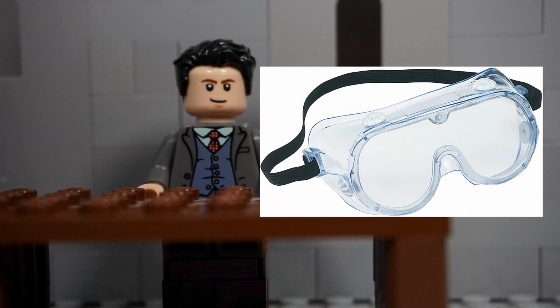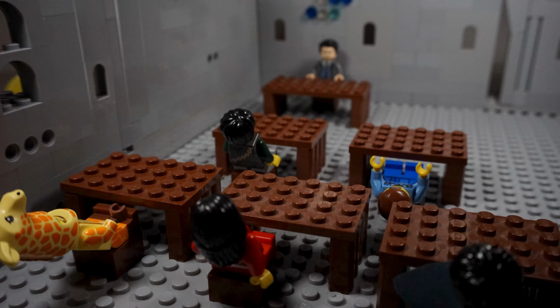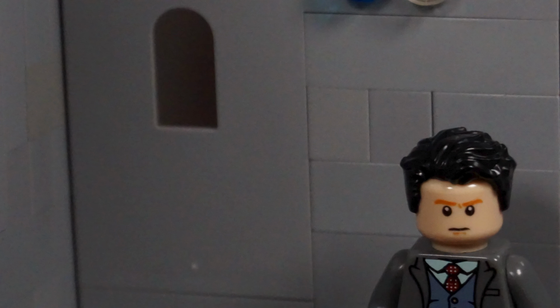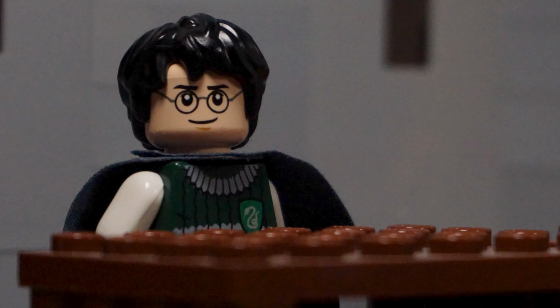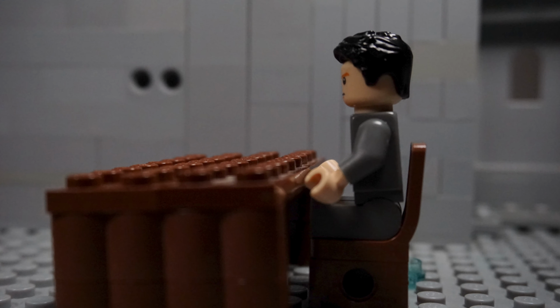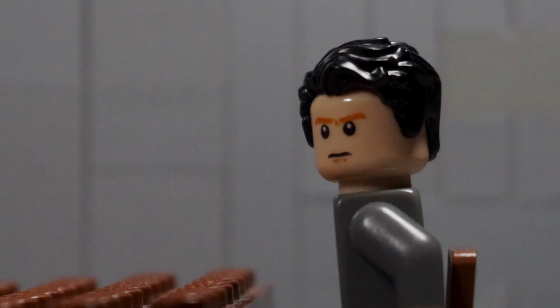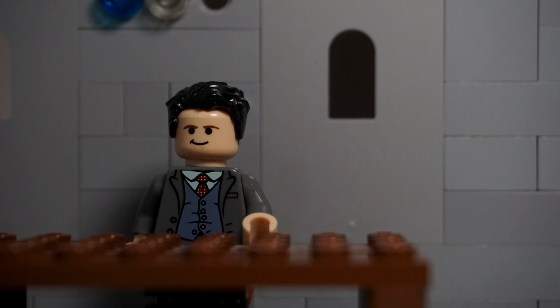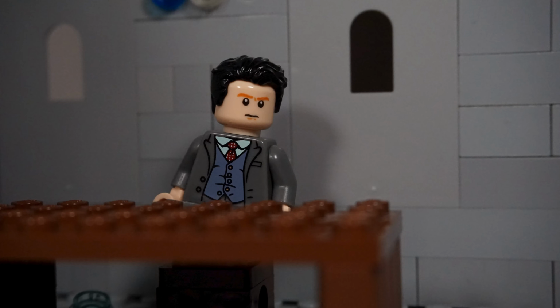You will need to wear these plastic goggles, even if you are not the person conducting the experiment. Oh, you stink! Get out of here! Okay, well, do you want to look like this guy? Actually, teacher, I wear glasses. Therefore, I will not need these so-called goggles. Do your glasses have shatterproof lenses, kid? Got him! Idiot! These goggles will protect you from a lot, but if a chemical does happen to get in your eye, we have eye wash stations. If you do get a chemical near your eyes, use these immediately.